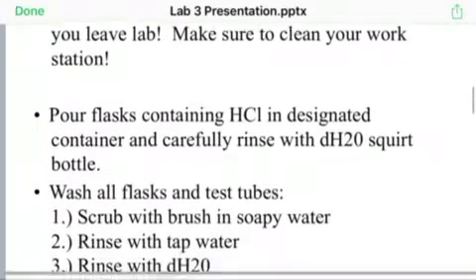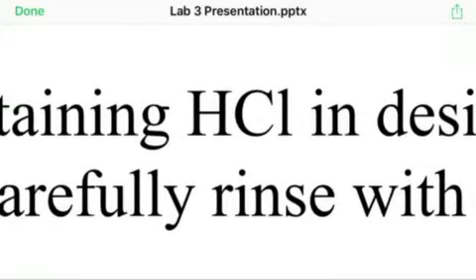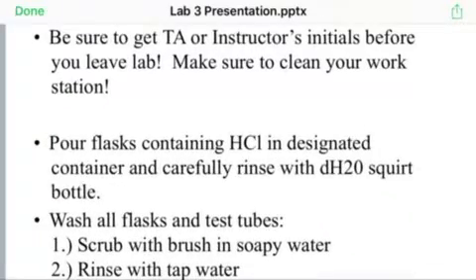Okay, so this is the cleanup stuff. Today we're going to be working with something called HCl, and this is an acid. This is a strong acid. It's not enough to really hurt you, but we'll definitely take some precautions when we're using it.